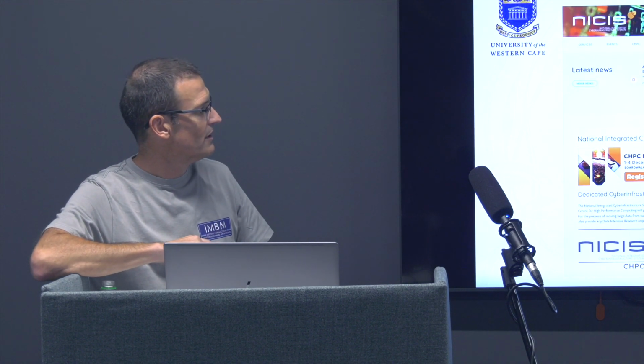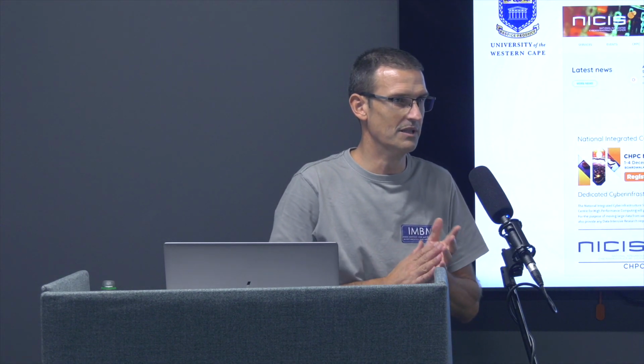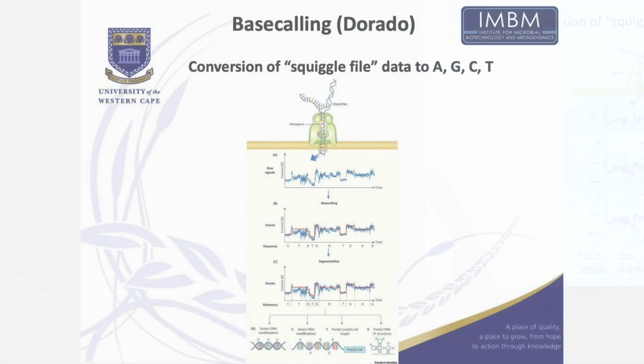If you're sequencing human genomes and so on, the data sets grow very large. So the RDSI is the storage facility that they make available. For IMBM, we've organized 100 terabytes of storage there, and you can upload as much as you want. They've got proper cold long-term storage as well as hot storage, so you can work with it in real time.